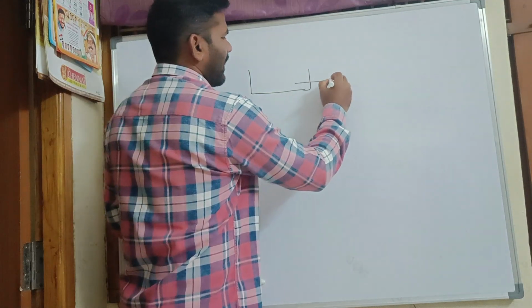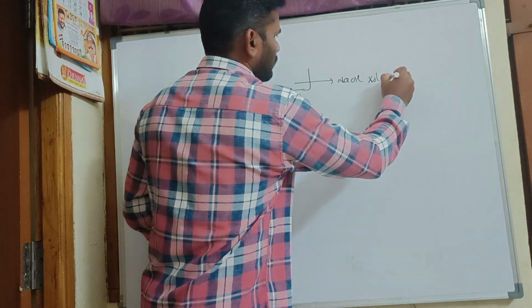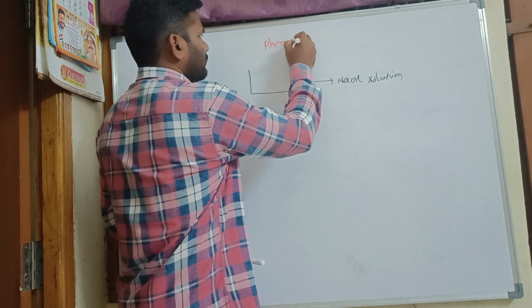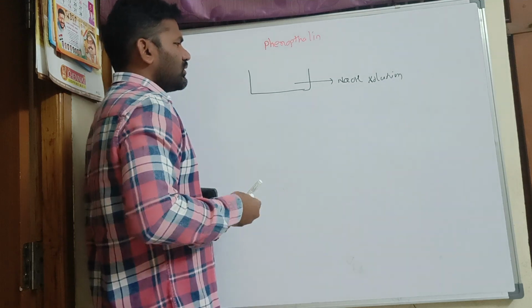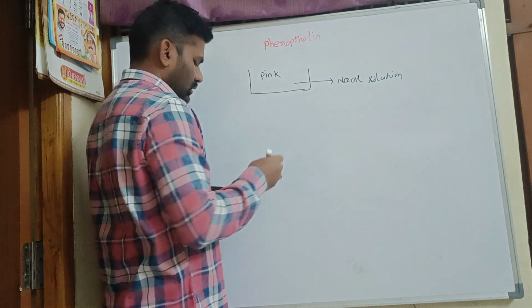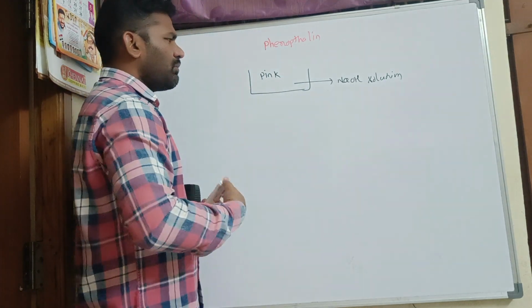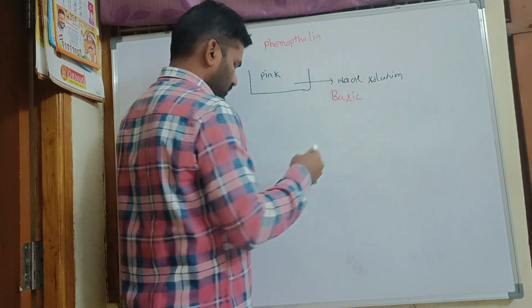In a beaker, I am taking a sodium hydroxide solution to which I am going to add a phenolphthalein indicator. Then the solution turns to pink color. Here, the solution turns to pink color, indicating that sodium hydroxide solution is basic in nature.